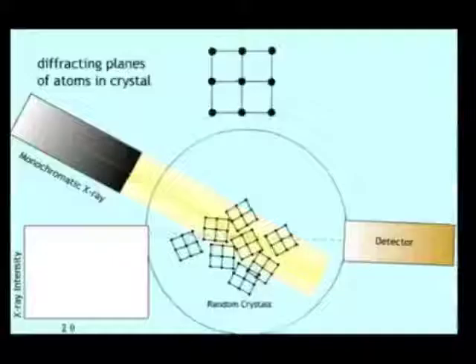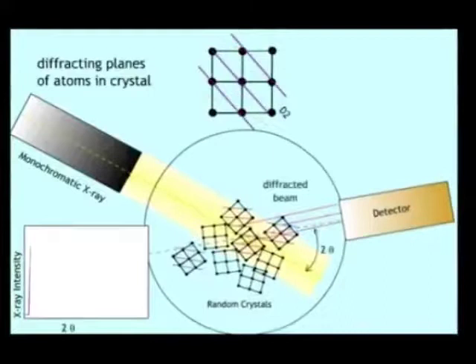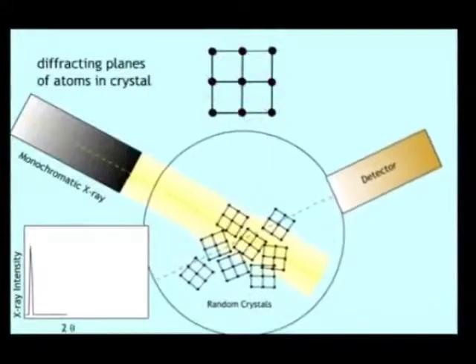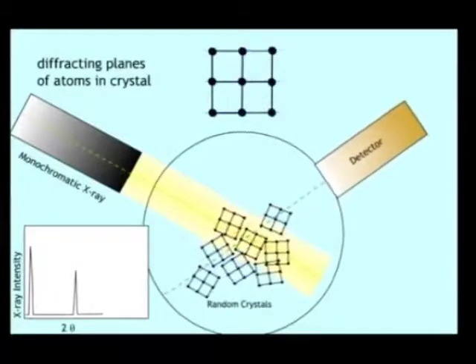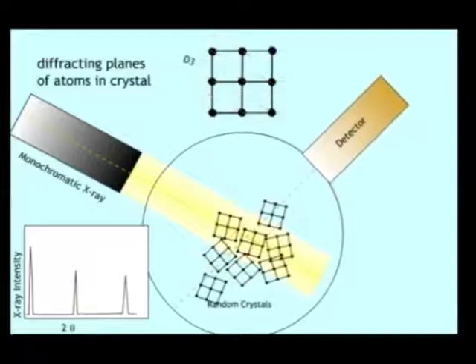A fine powder material contains many crystals located at random angles. Certain crystals happen to be oriented so that the X-ray beam, crystal, and detector satisfy Bragg's equation. This causes a signal spike at specific detector angles. It is important to have a sufficient number of crystals to have an even distribution at all possible crystal orientations.